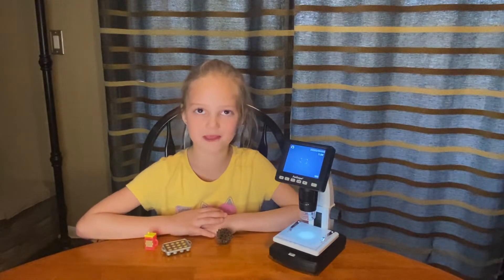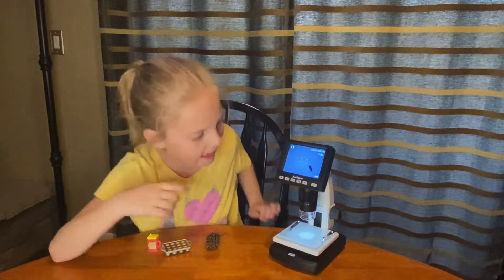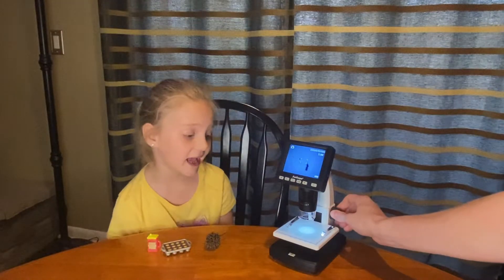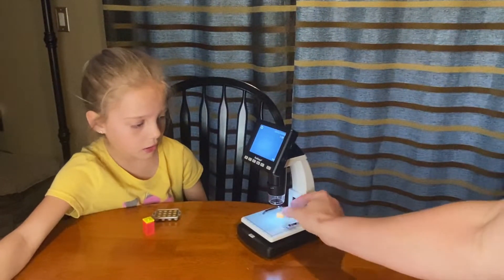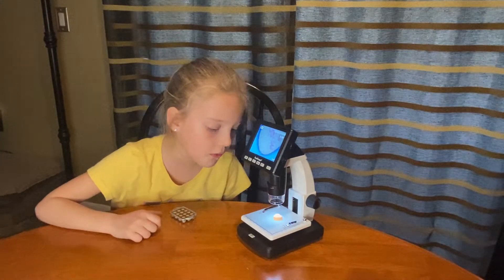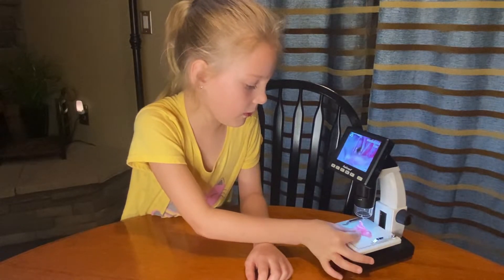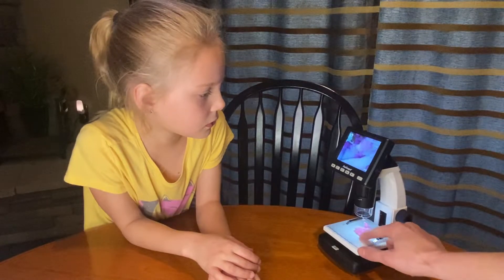Now we got some things from around the house and outside — let me show you. Let's see the ant first — we found an ant. That's so cool, guys. Some candy. Let's try another thing — let's try this flower. There's something on that. Cool, right?